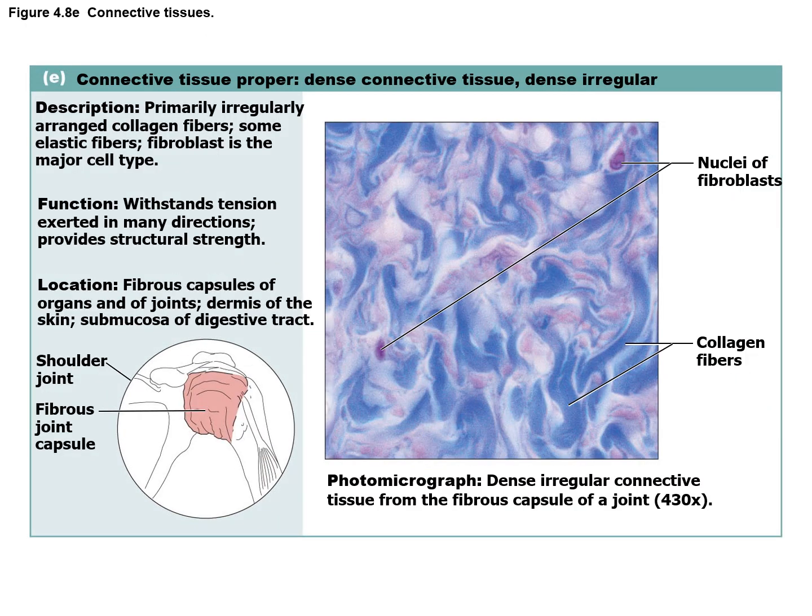Our second type of dense connective tissue proper is dense irregular. Here we can see the fibers running in all different directions. In regular, they were all parallel to each other. In dense irregular, they're running in all directions. Therefore, dense irregular connective tissue proper has strength in all directions, not just in one plane. We see this in some joint capsules, but a big area where we see it, what we'll take up later in this course, is in the dermis, which is the deeper layer of skin.